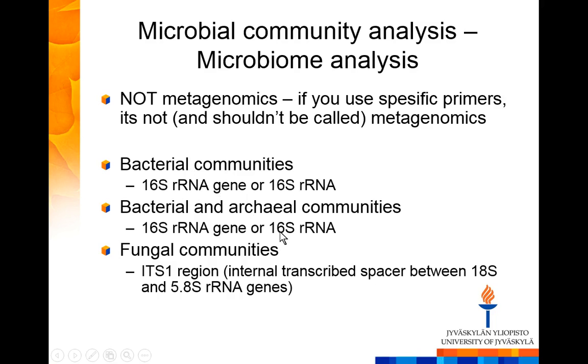Nowadays, there are also very much used primers that cover both bacteria and archaea, with the same primers and the same analysis. Some people say that such primers would never work ideally for both groups, but they are used very much, and most often I think they give you what you want. And of course, it's very convenient if you can, with just one analysis, cover the entire prokaryotic diversity.